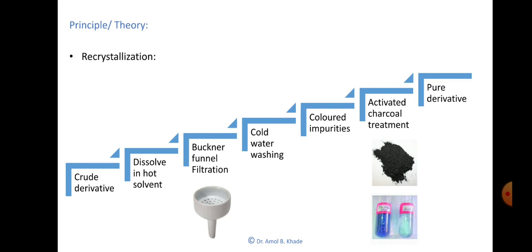Okay, so this is referred to as recrystallization. Here the selection of solvent plays an important role. You have to select the solvent in such a way that it will dissolve the product and not the impurities. It should preferably have a low boiling point.